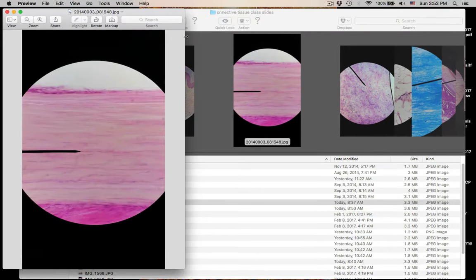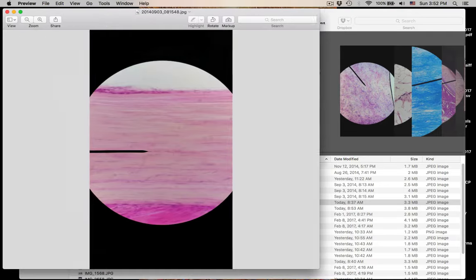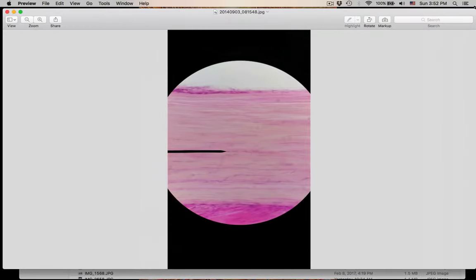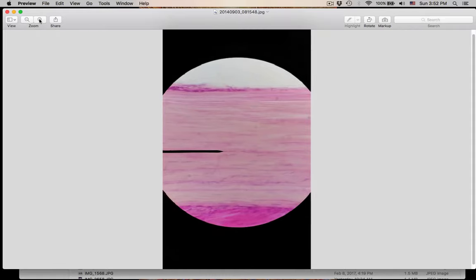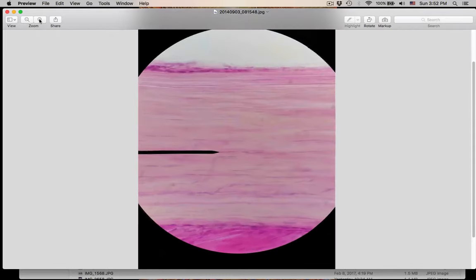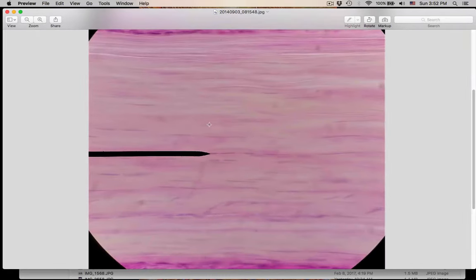This one's a little bit blurry. Sometimes these are blurry just because the specimen is so thick. But can you tell, just by the pattern here, what kind of connective tissue this is? This is number seven.